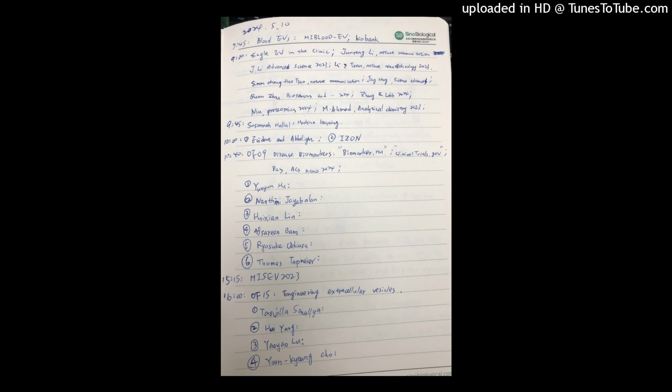Whether it's for long-term storage, short-term storage, or whether you need to do your analysis on a freshly prepared sample. For analysis, working with EVs has a lot of options and also possibilities. But first of all, you need to consider: should I isolate my vesicles prior to the analysis? And how should I isolate them?